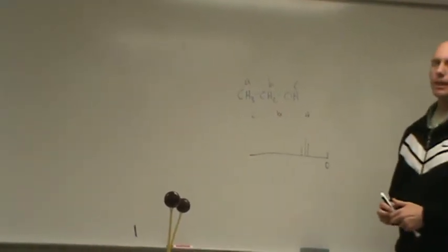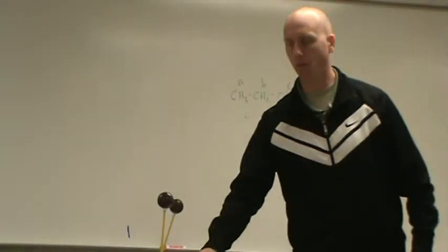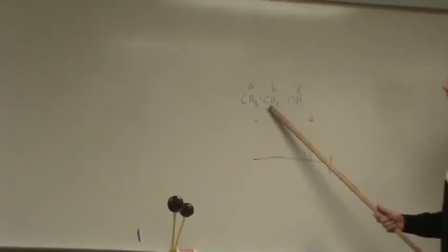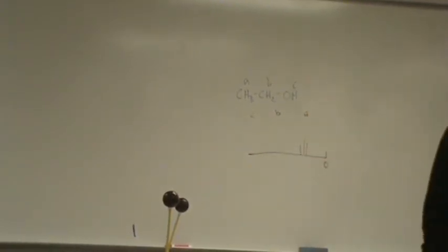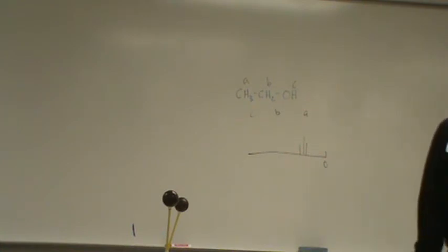Need to give you some help. Okay, you can write it down. OH hydrogens will not split CH hydrogens.